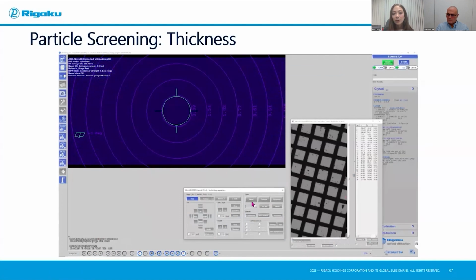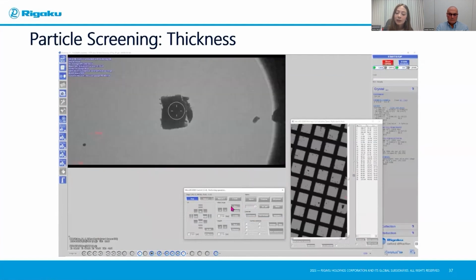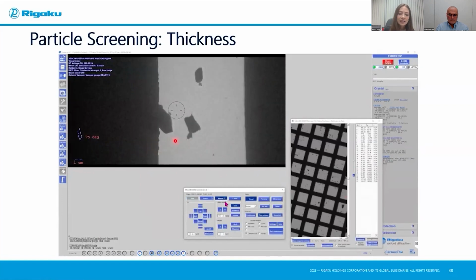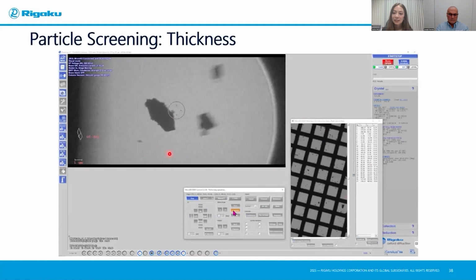And this is what we mean when we say sample thickness, that samples need to be less than a micron in size. It can be tricky to gauge this just looking at the crystal visually. So what I've done here is tilt the sample. You can keep track of that tilt here. And with this 1 micron scale bar here, you can get a rough idea, seeing that this is around a micron in thickness.